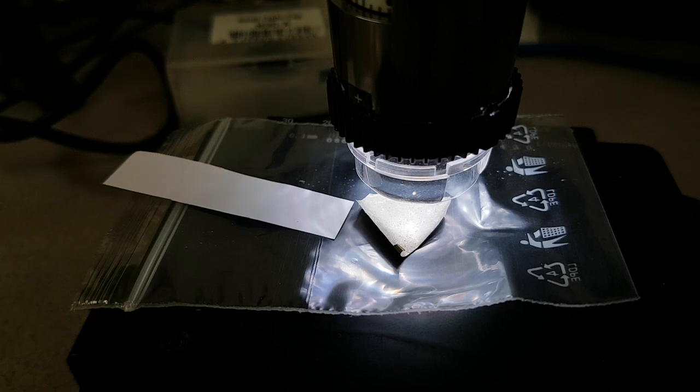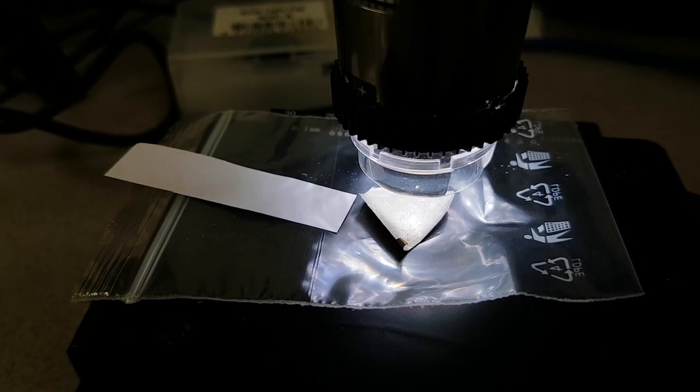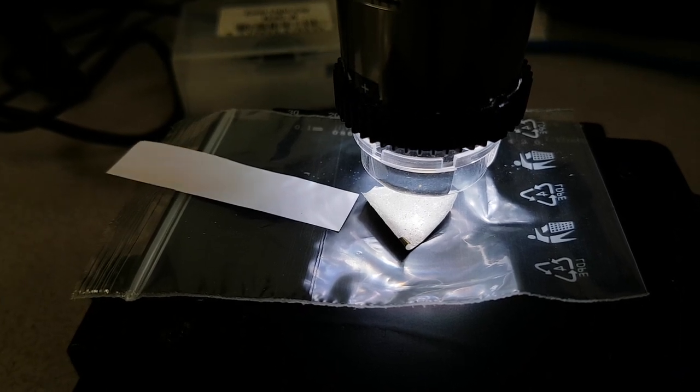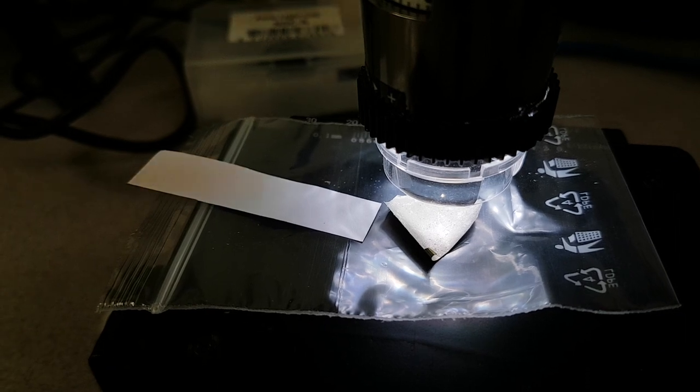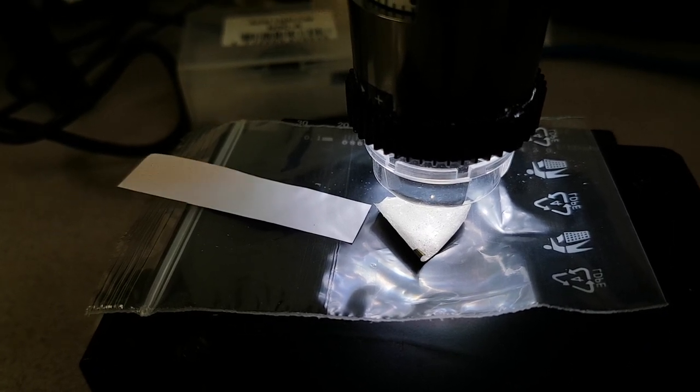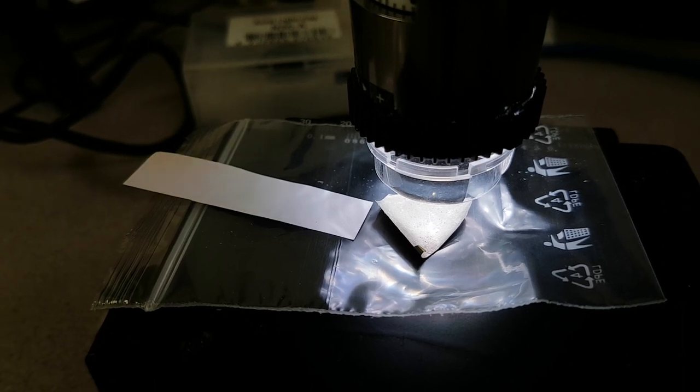I'm looking at some echo foil that we got from India in 2017, and I wanted to give it the digital microscope view so we can see any color or structures before shipping these samples off.